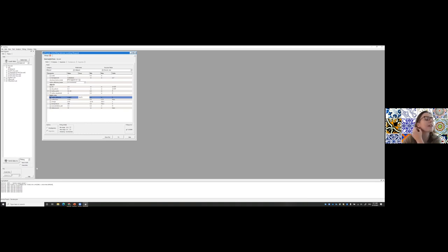Yeah, so you can. There are options. If you look at the Data Explorer window here on the left, you can see there's an option to click for batch mode that I didn't click here. So let's say, just for the sake of an example, we were not going to fit a structure factor. We just want to fit a form factor, and we presume the form factor will be the same for the 1 mg/mL and the 100 mg/mL data. So we want to fit them both with the same form factor. Then you would click there, load the two data sets, and that would constrain the fit to have the same values for both. So you can do constrained fits.